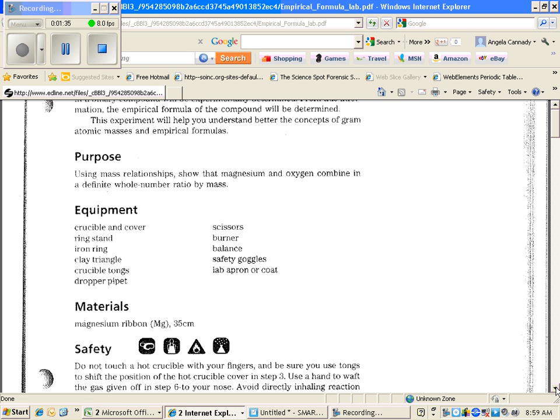Remember, the purpose of this experiment is to show that magnesium and oxygen combine in whole number ratios. We're going to take magnesium ribbon and oxygen from the air and react them together. We're going to burn it.